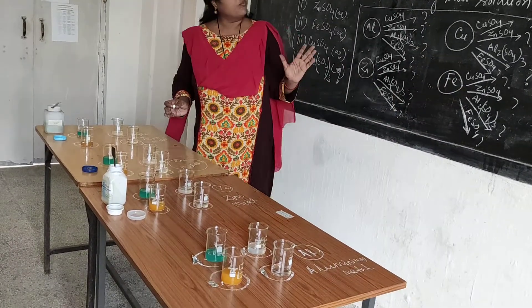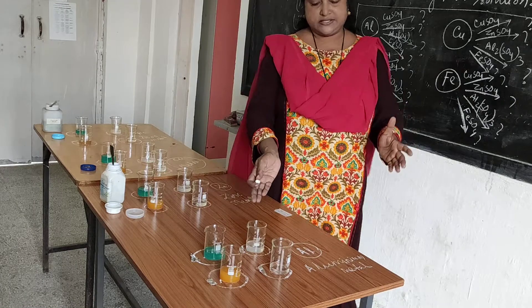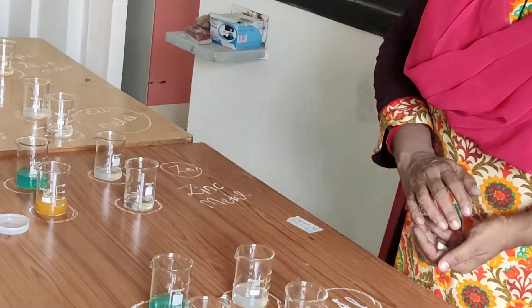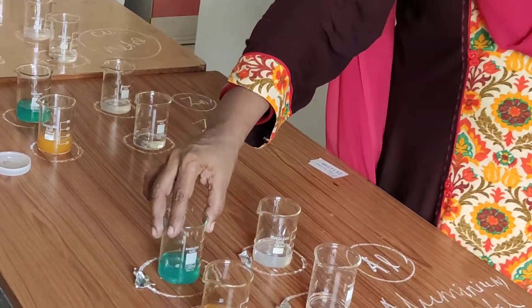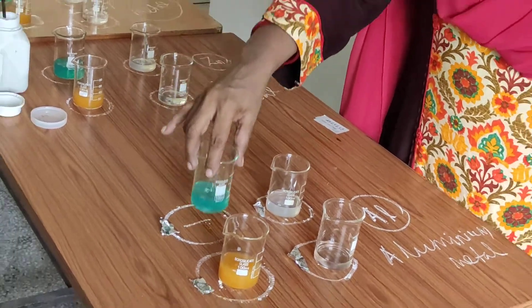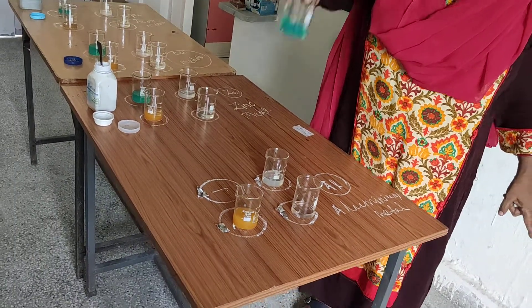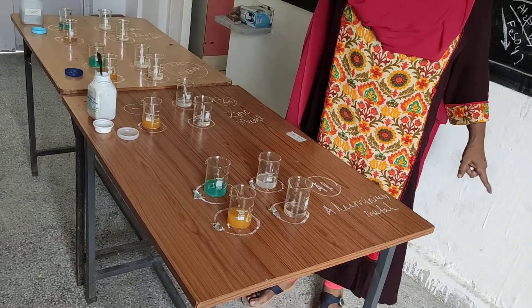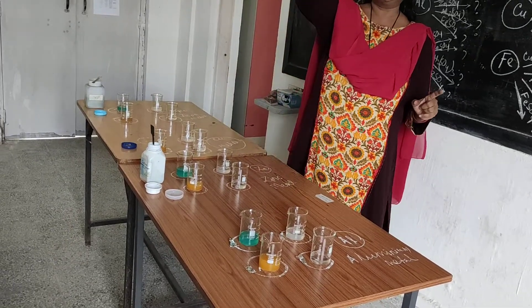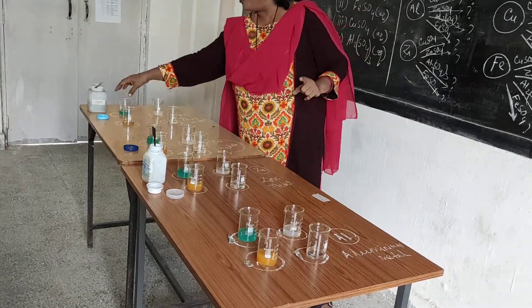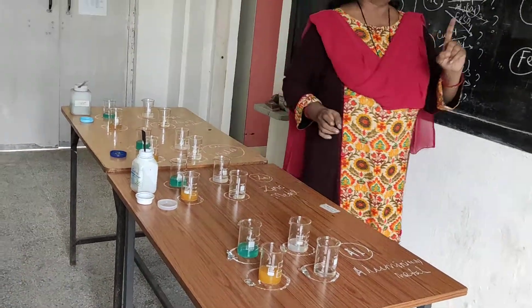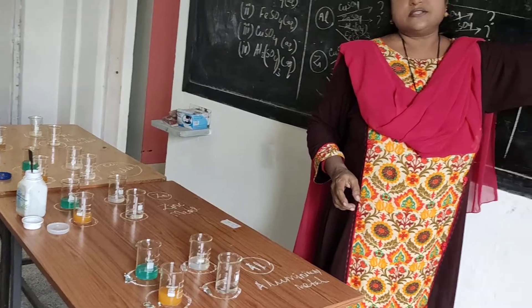I have set up table 1 here. You are seeing 4 beakers arranged here. This is numbered as 1 — beaker 1 is copper sulfate, a blue color liquid you are seeing. Table 2 beaker 1 is also copper sulfate. Table 3 is also copper sulfate. And table 4 is also copper sulfate. Beaker 1 for every table is copper sulfate solution.